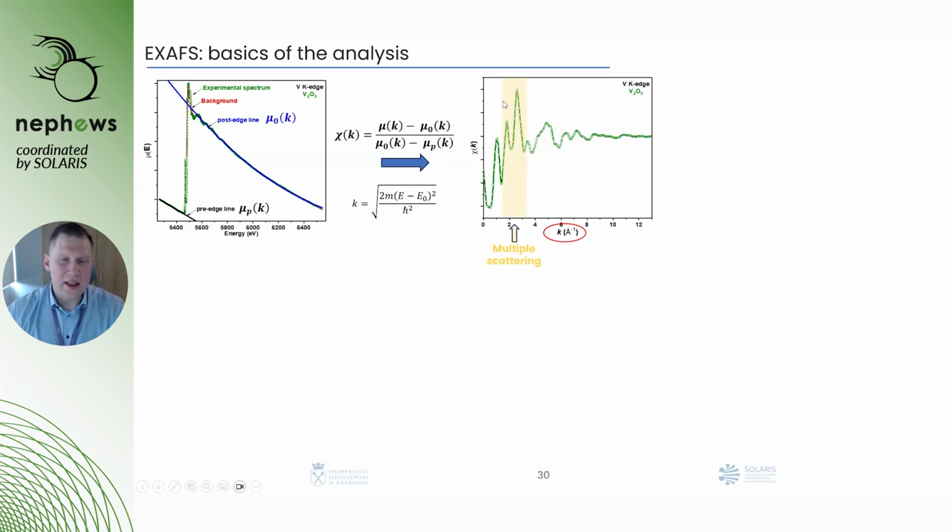This region of intense oscillations we analyze when we analyze the XANES region. These oscillations which are not quite pronounced, we analyze when we make an EXAFS analysis.